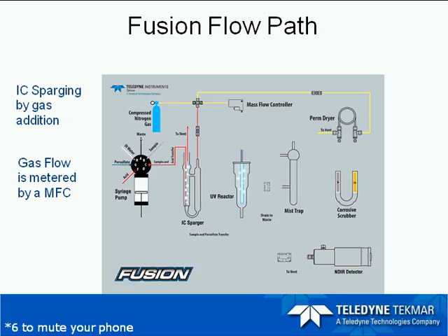And a nice point to mention here is that we are metering the gas flow by a mass flow controller. So you have immediate systematic control of your gas flow through a mass flow controller and not through flow restrictors.